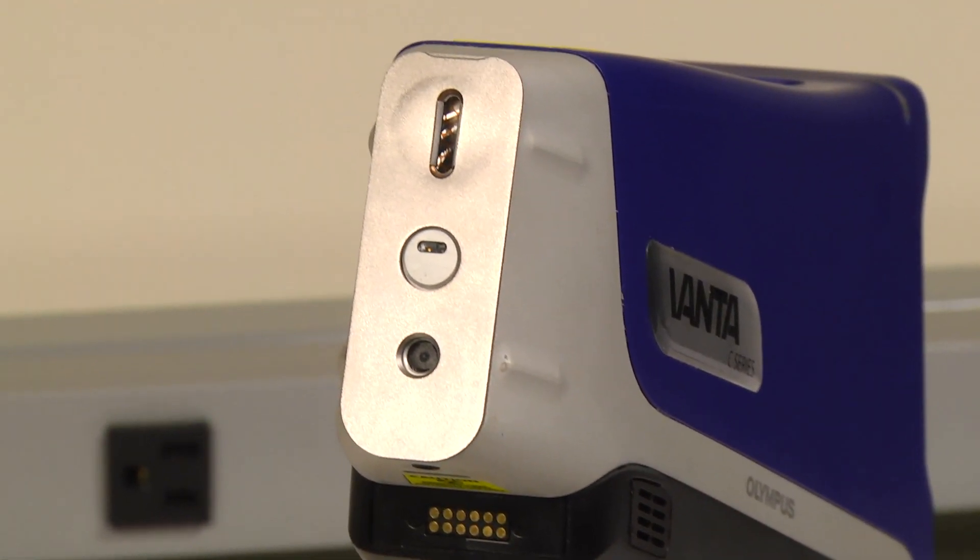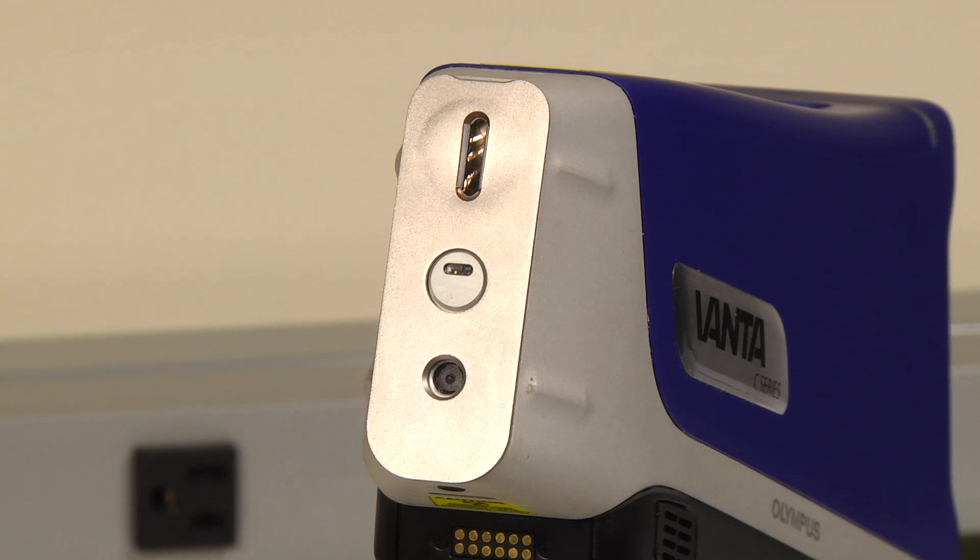Hi, my name is Alex Thurston and today I'll be showing you how to use the Vanta for weld inspection. Using the Vanta for weld analysis is enhanced by three things: number one being the use of the weld mask faceplate as shown installed on the instrument here, two by selection of the proper test times, and by selection of the proper grade libraries on the instrument.